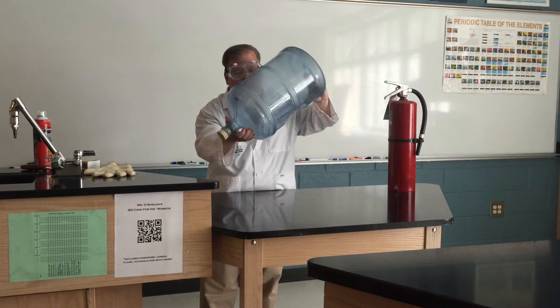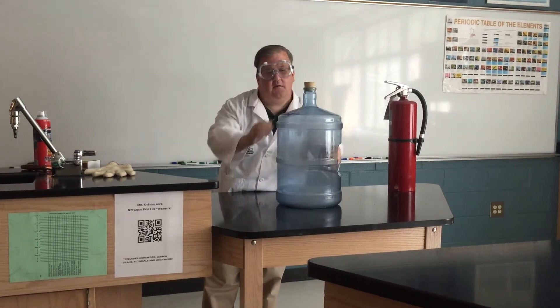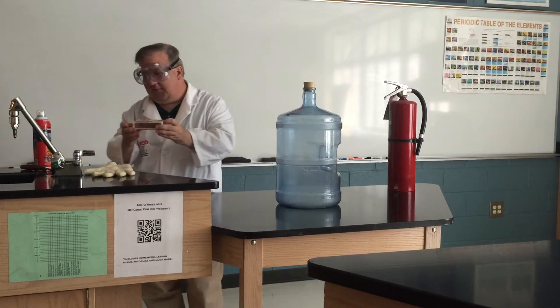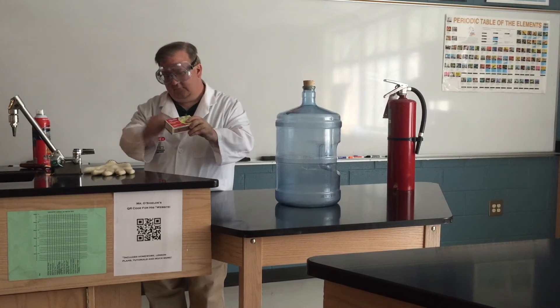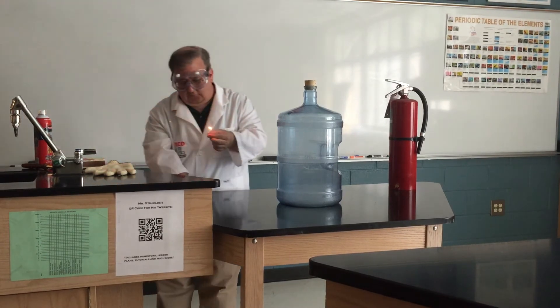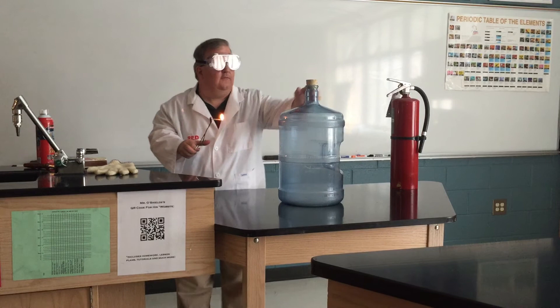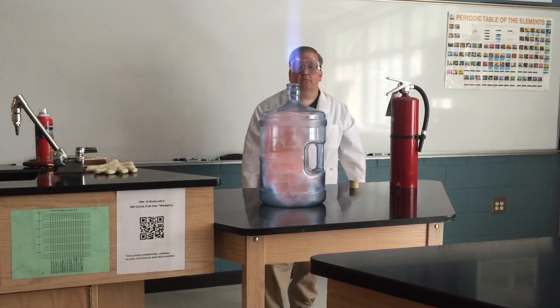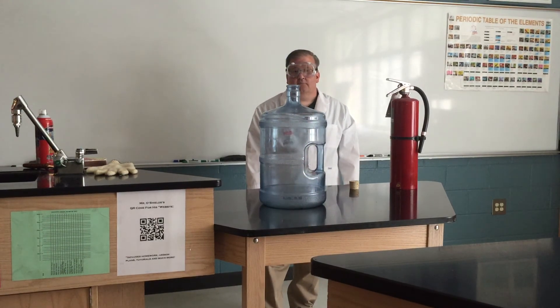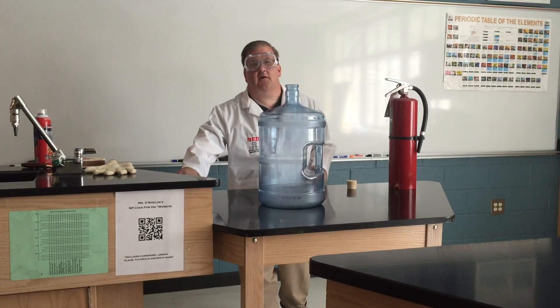Now that should be good — the inside of the bottle is coated. I'm going to light a match, and I'll hold the match with my crucible tongs before I drop it in. Let's see what happens. And that's the whoosh bottle demonstration using isopropyl alcohol.